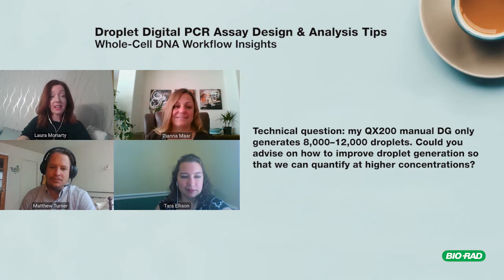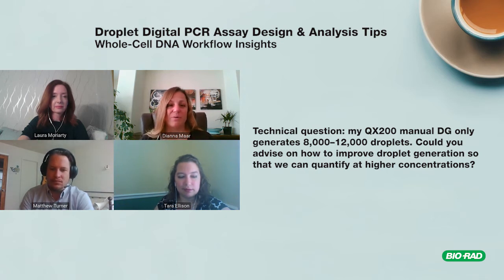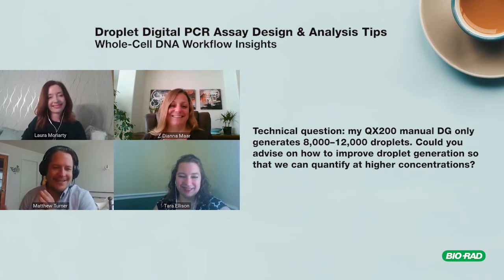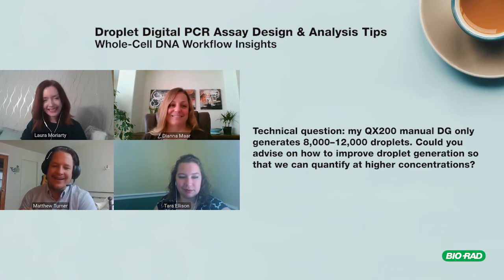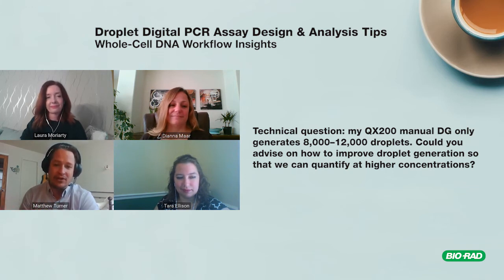Diana added: proper vortexing of all reagents prior to making your supermix, as well as after adding all components including the sample, is really critical for making good properly sized droplets. Unlike qPCR where heating and cooling mixes the sample, with droplet digital PCR you're creating droplets first — so if you didn't mix thoroughly, some droplets will have a lot more components than others. Everything needs to be evenly dispersed across the sample.